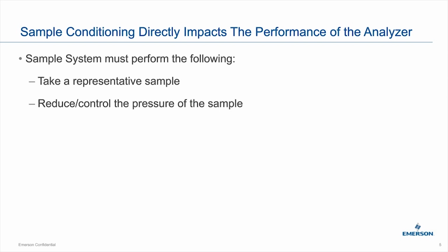To remove solids, you will see that it's very critical. Every sample system or any stuff flowing through the pipe picks up gunk. And the GC doesn't really handle that well, so we need to remove that before they get to the GC. So we often recommend various different types of filters.